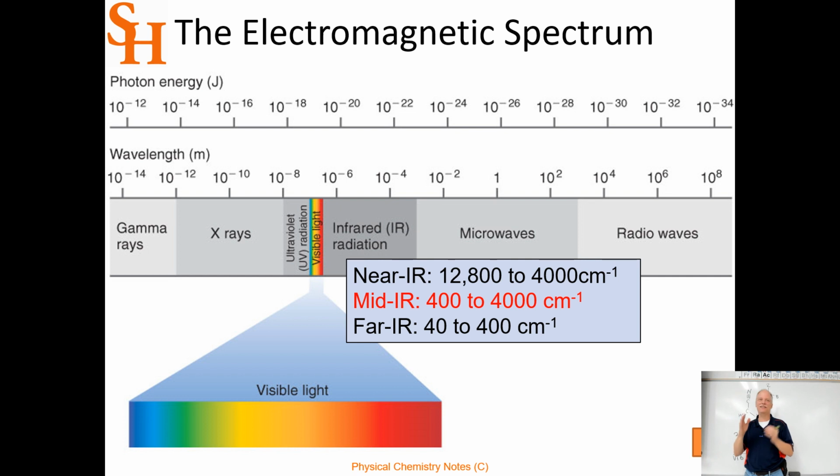So we set the instrument to collect data from 600 to 4,000. And so we don't have to worry about those noise peaks anymore. But that's why it doesn't exactly match the traditional mid-infrared region. We're only going from 600 to 4,000. Now in the mid-infrared, that happens to be the sweet spot for all of these vibrations. The stretches of our atoms from each other and the bending motions of those atoms.